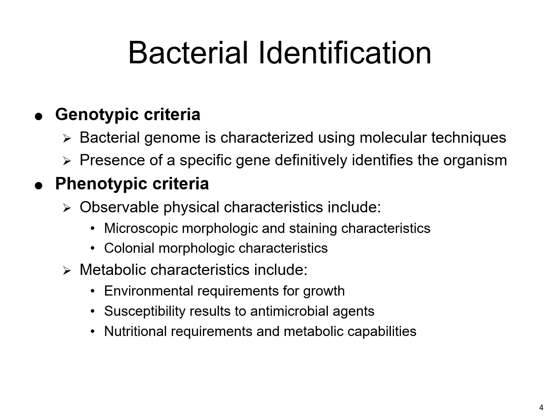So you're looking at it microscopically, how it stains, what it looks like under the microscope. You're also looking at it macroscopically, so the growth characteristics on an agar plate and how it grows with different media. You're also looking at the metabolic characteristics, so this is the growth requirements, the susceptibility testing to different antibiotics, and also some of the nutritional requirements and how it metabolizes various things.